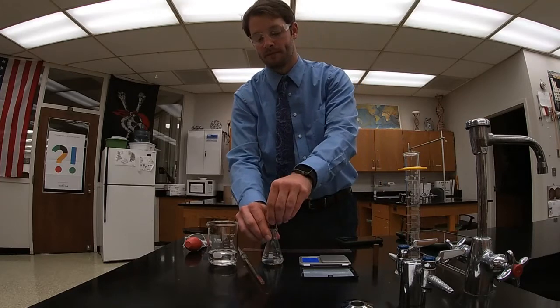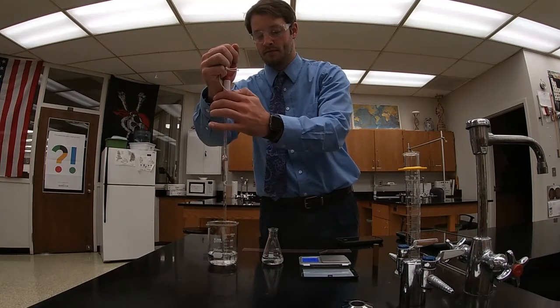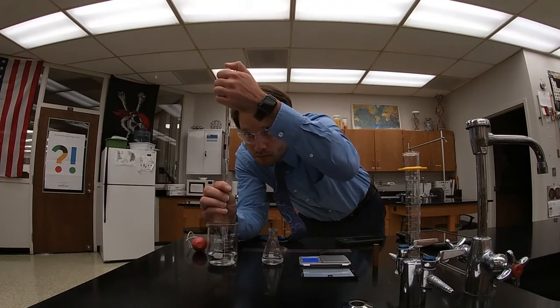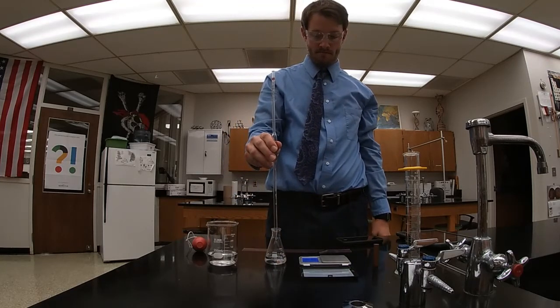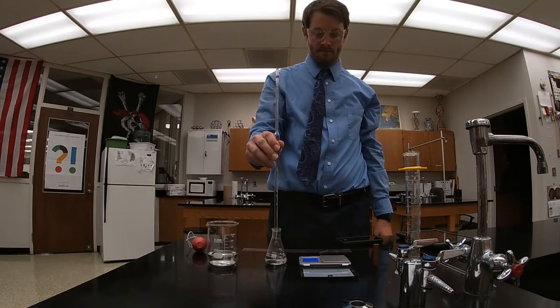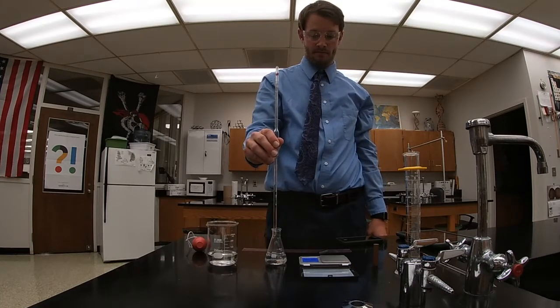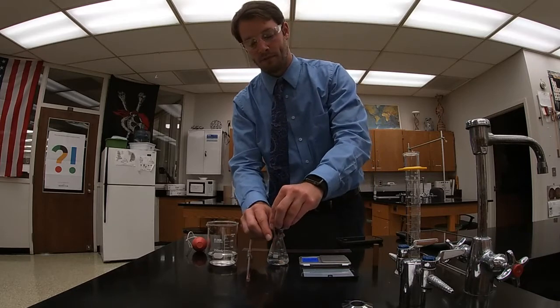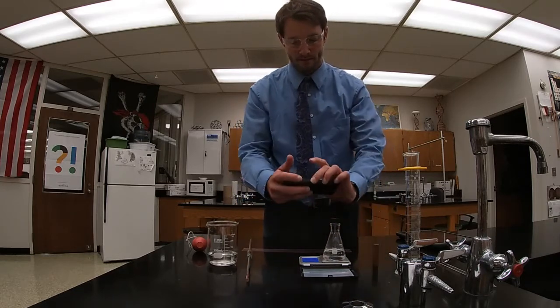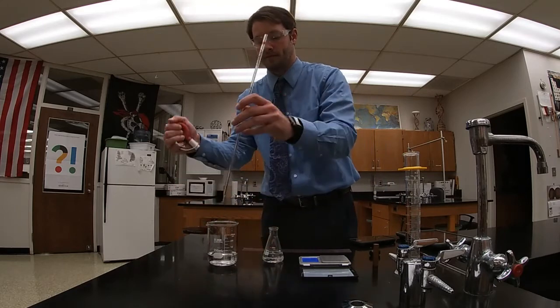I want to add a third portion. Stopper it, get the mass, and I'm going to add my fourth and final portion.